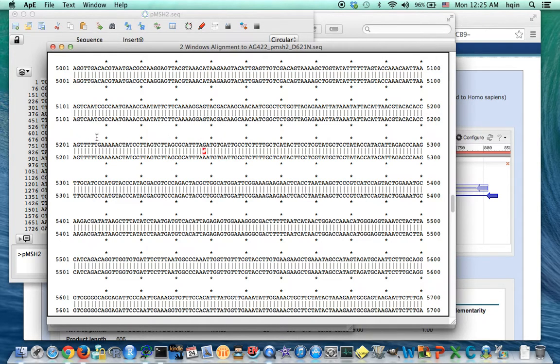And we can find the mutation roughly here. This is 5201, 10, 20, 30, it's about 38, so 5238.